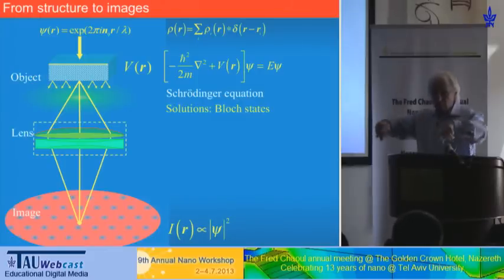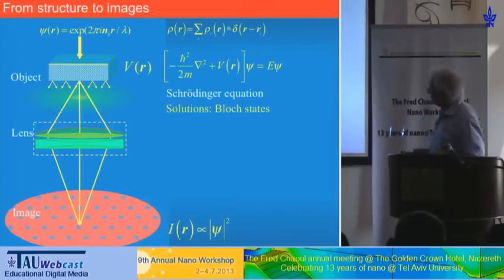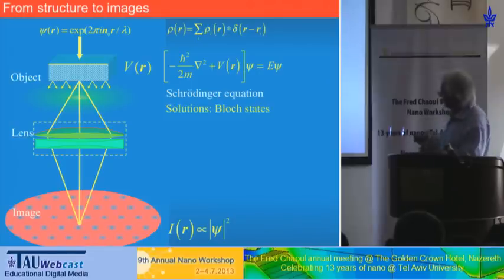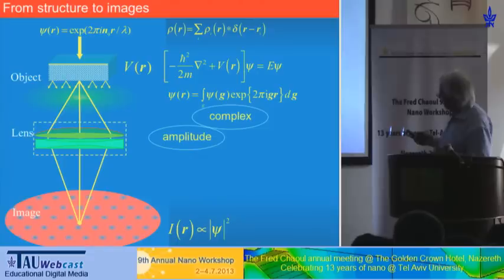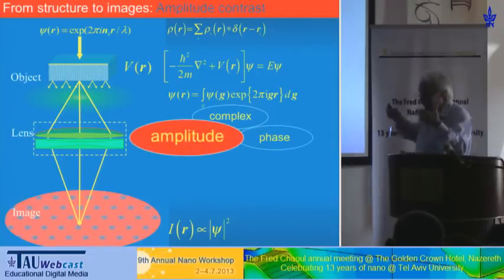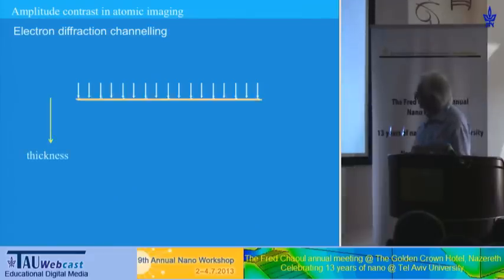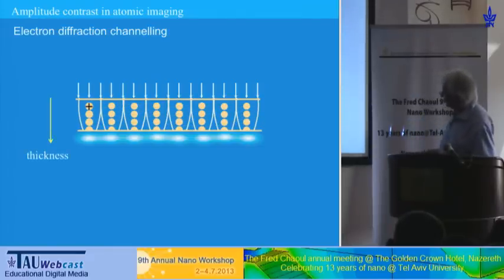So when we want to exploit our instrument to the limits to measure what we can measure, then of course we have to care about amplitude and phase and measure this. Nevertheless, you can intuitively understand quite well what the amplitude and the phase part means, and this is what I want to visualize for you now. We first deal with the amplitude part. The amplitude part can classically be quite well understood. Assume that we have a specimen surface. Here we put on a parallel electron beam. The thickness increases in this direction of your specimen.